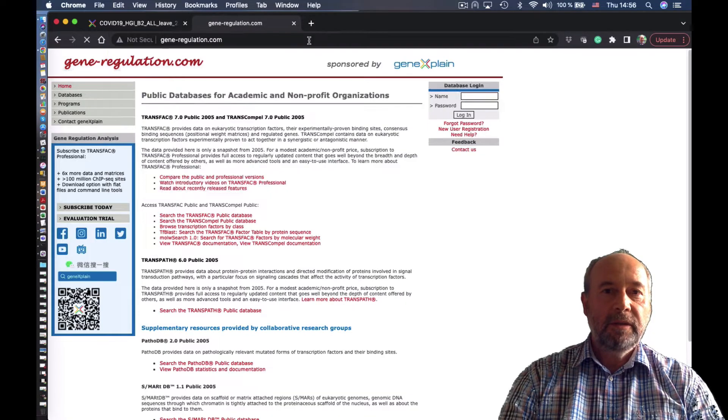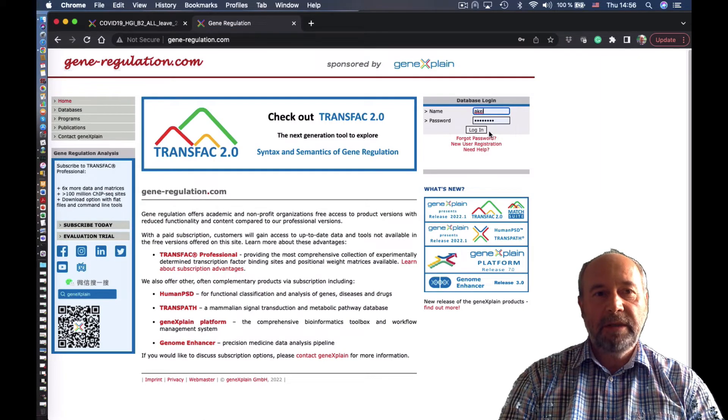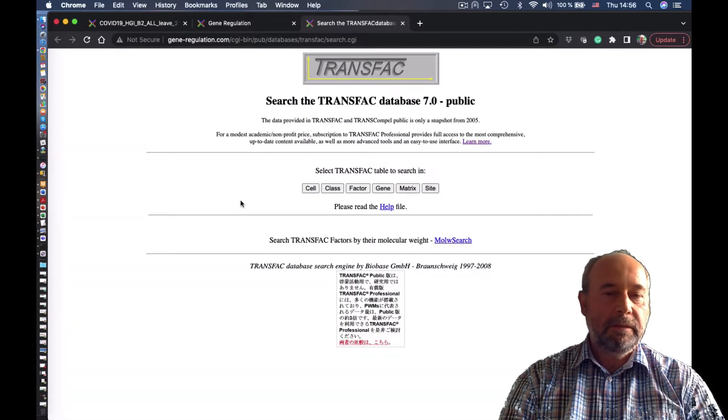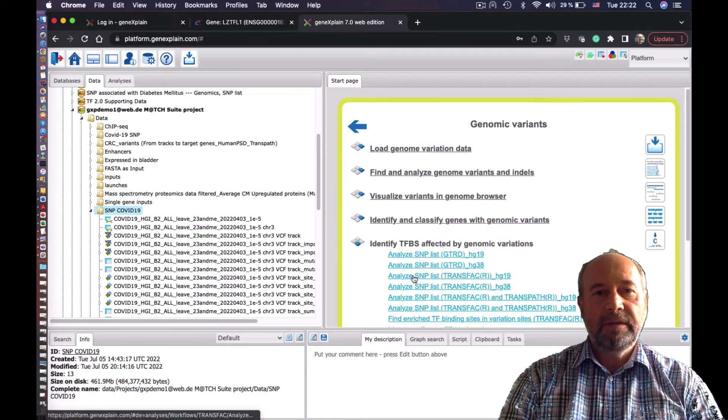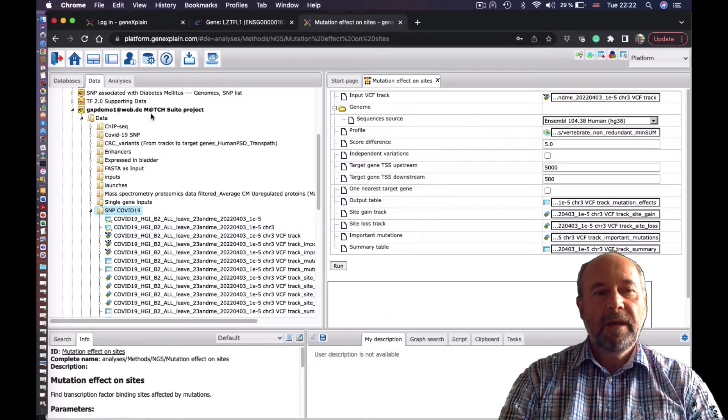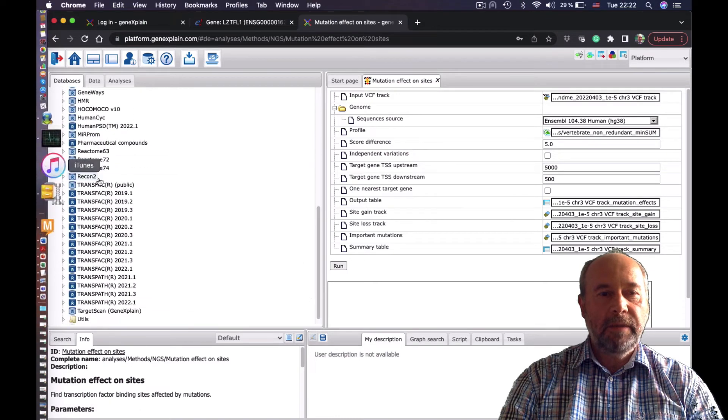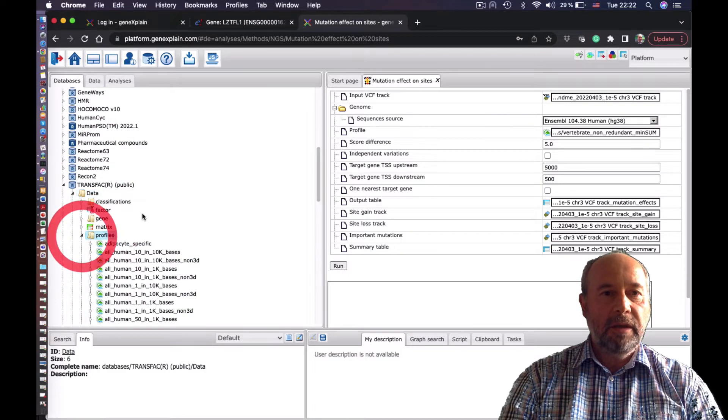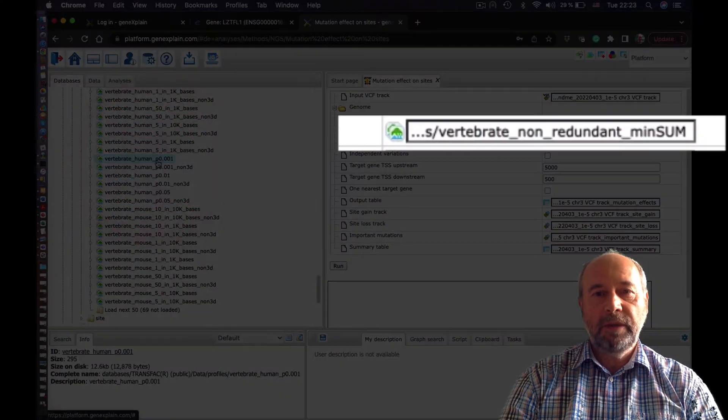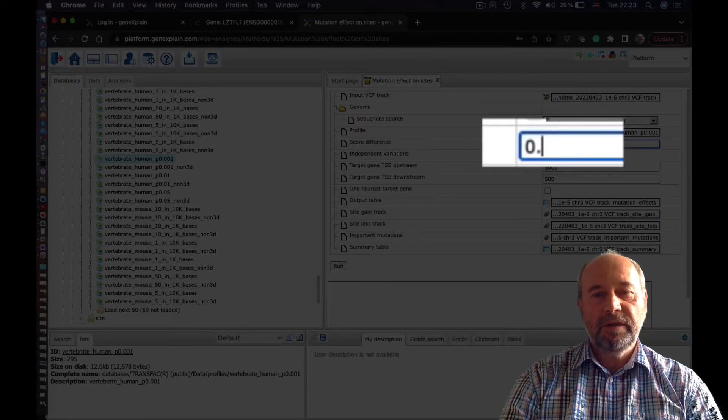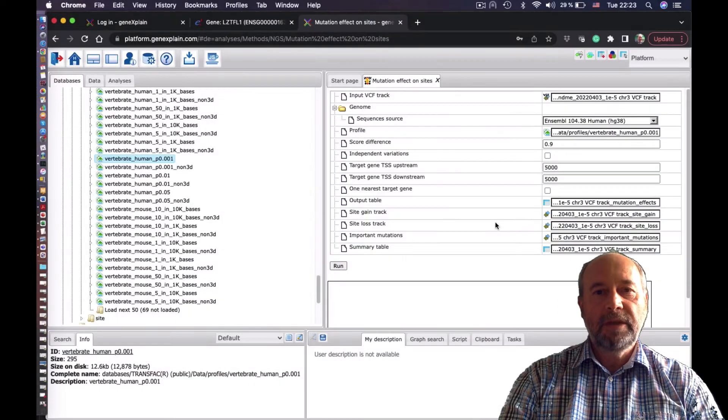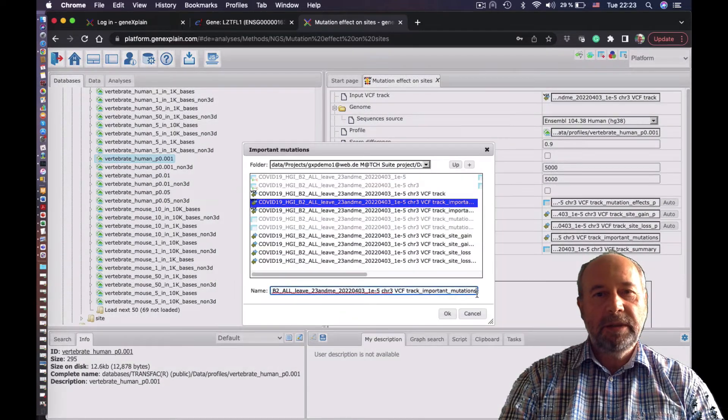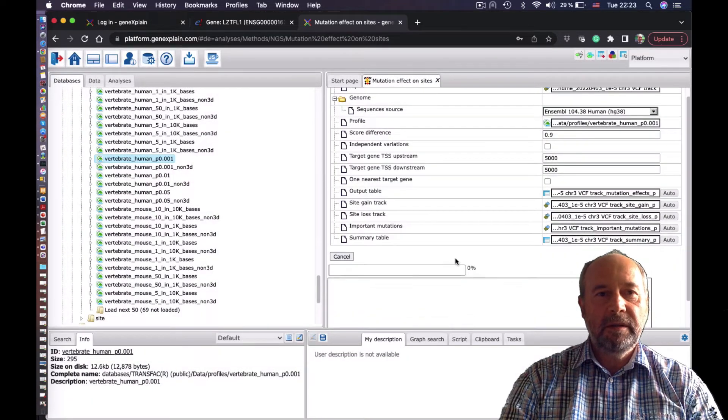Let's have a look at Transfac Public. So let's do the same using the Transfac Public database. Basically, we have this database containing a few matrices, much fewer than in a professional version. But we can run it here in the platform. We have Transfac Public here. To run it, we have to take the Transfac Public profile and put it in the same program. Let's put the same cutoff, the same regions to the gene and change the name of the output. Now we see the result.